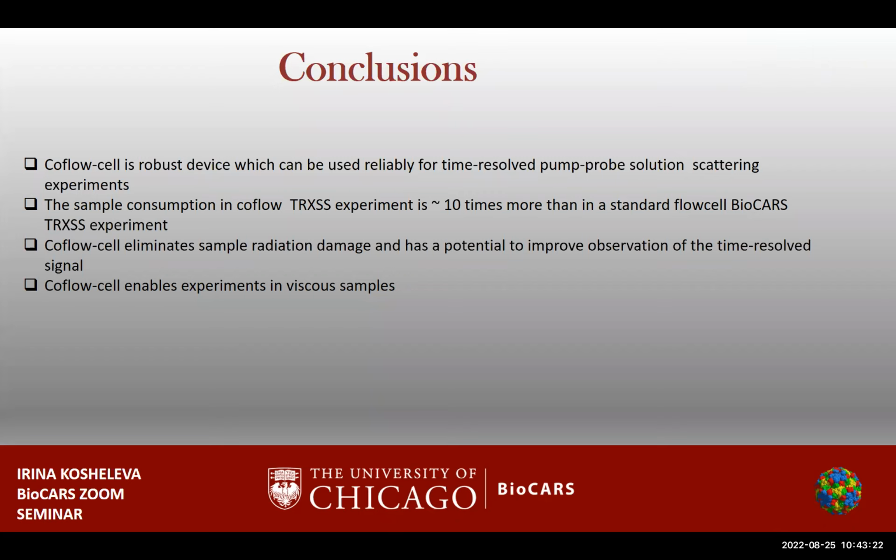Okay. Maybe you have another question. When you look at these long time delays, like 15 milliseconds, 100 milliseconds, do you need to scan your laser beam to offset the displacement of the pump volume? That's what I did. I didn't actually scan it. On the basis of the velocity, which is at this point already fairly uniform, I offset the laser beam, and that's how I recovered the signal.